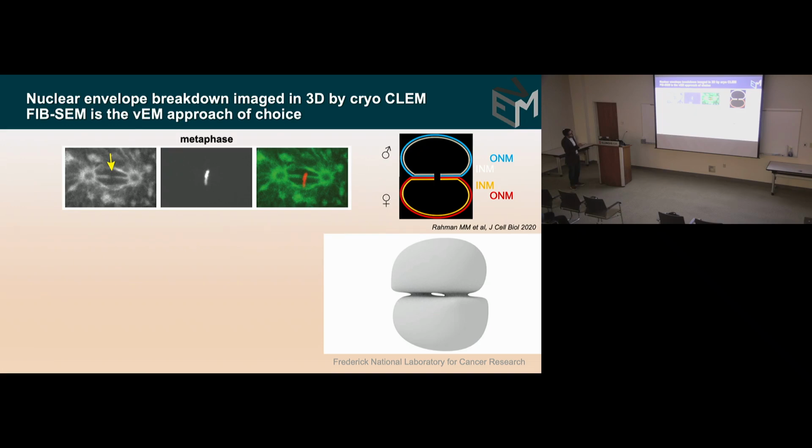And you can see the condensed DNA in red. And you can tell that when the maternal and paternal DNA line up at the equatorial plane, they do so with a little bit of a gap. So there was this hint that there's a gap that does form, and of course it must form at some level, right? Because otherwise, how do you even get fertilization? But what does that gap really look like?